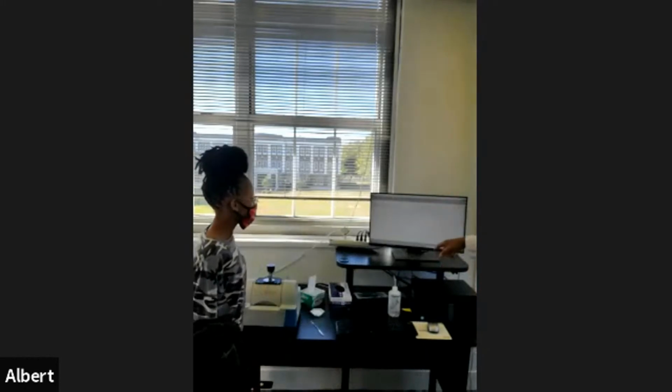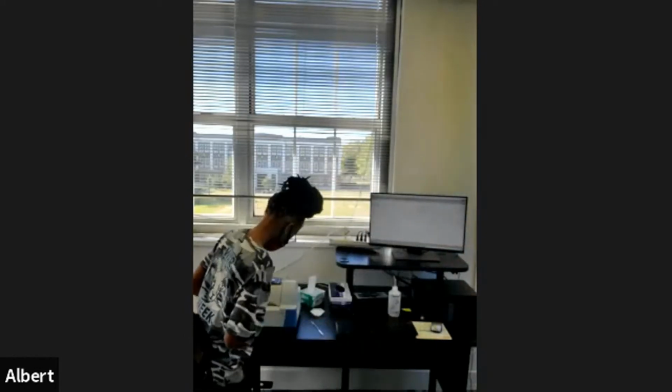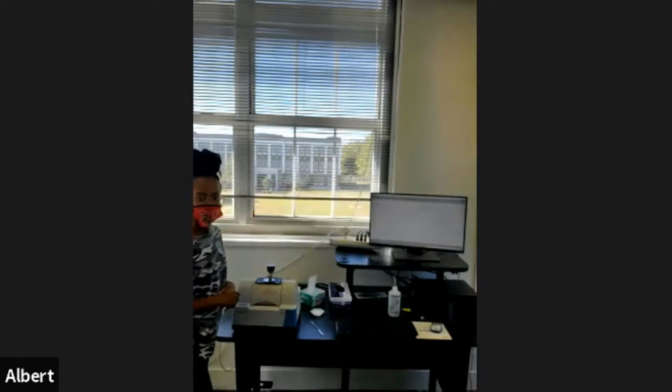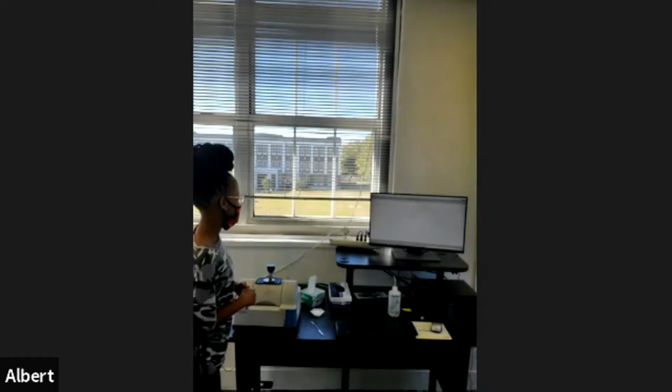The first one, the top one. You can go ahead and, remember, it gives you only the preview. You have to hit start collection to go through the whole 32 scans. Just keep doing it. Yeah. So now it's going to go through the 32 scans. Yeah, that's much cleaner. You can see that right away. It's better, but that first one, whoever did that, did a marvelous job.